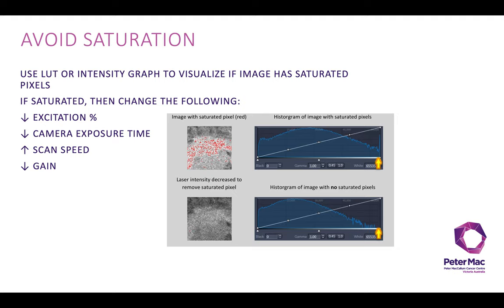Another way to avoid saturation: a lot of imaging softwares have a special lookup table which shows you if there are saturated pixels. In the example shown, the red pixels within the image are saturated, also visible in the image histogram as a peak at the very highest dynamic range value. If this is the case, you can decrease your excitation power percentage, decrease your camera exposure time, increase your scan speed, or decrease your gain if you're on a confocal.